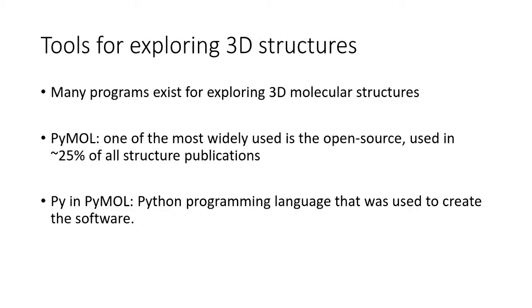Now, there are also many programs that will allow you to explore the 3D structures of your molecules, and PyMol right now is one of the most widely used. It is open source, and free for educational purposes. In 25% of all publications with protein structure, people have used PyMol. Py stands for Python. Since it's free, it's not extremely user-friendly.